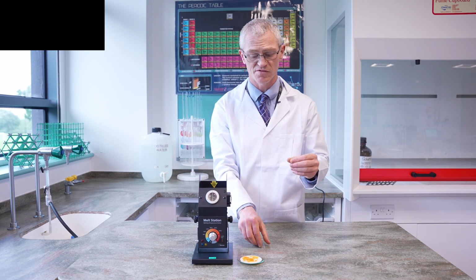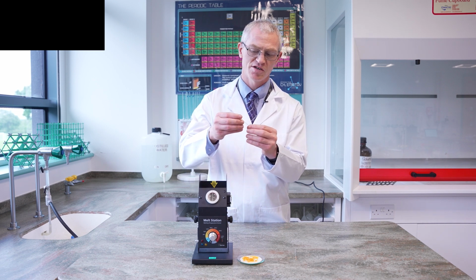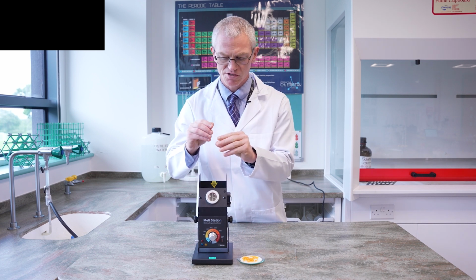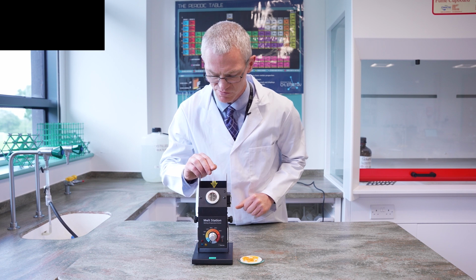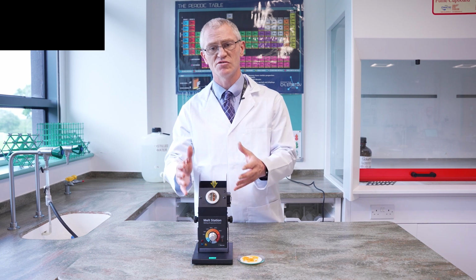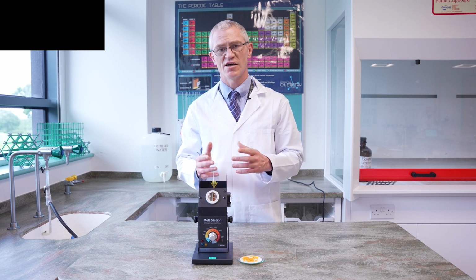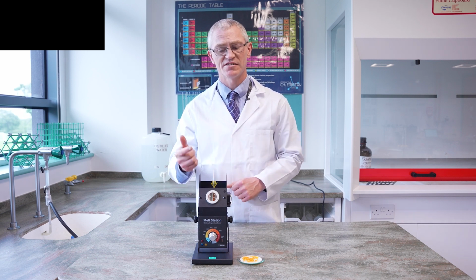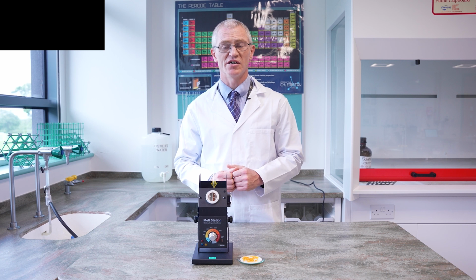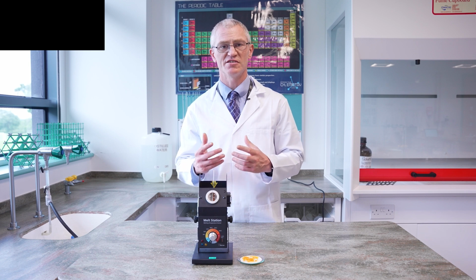As with a kind of Blue Peter moment, you have got a pre-prepared tube here which has your solid in the bottom. All you do is take that and put it into your melting point device, and lots of schools have devices like this. Then you set it to around about the temperature at which you feel it's going to melt. Now all we do is look at the window, and we'll see what it looks like when the 2,4-DNPH derivative melts, and we'll monitor the temperature.